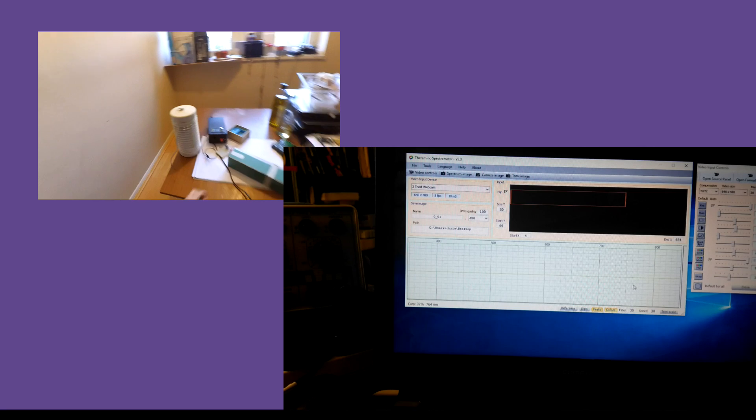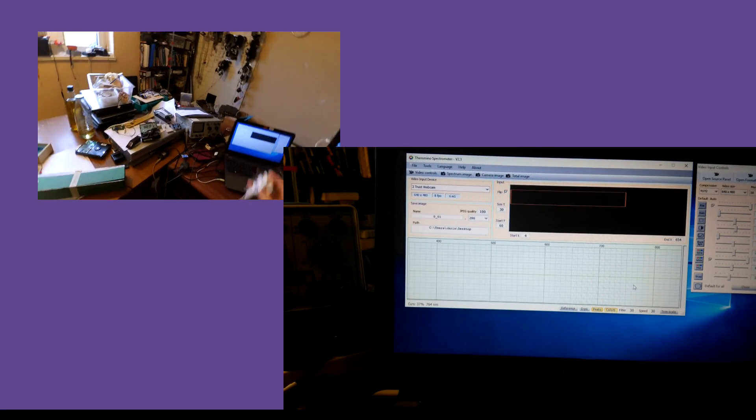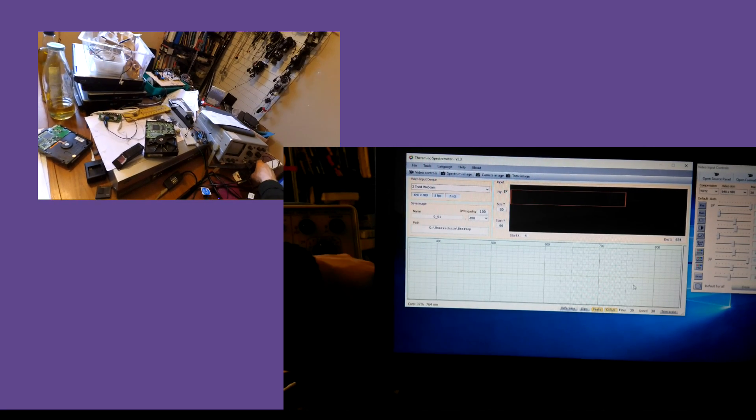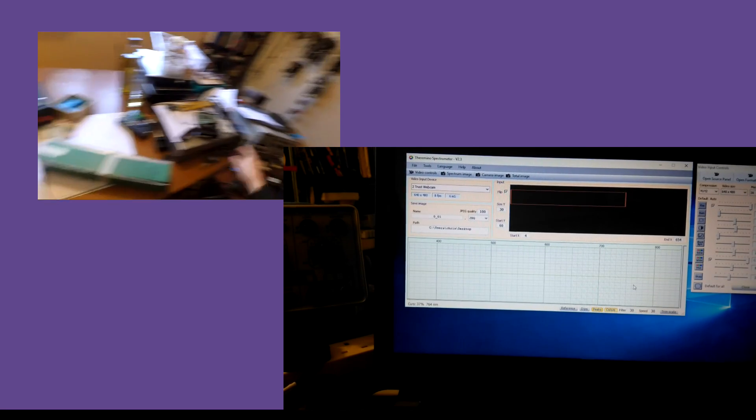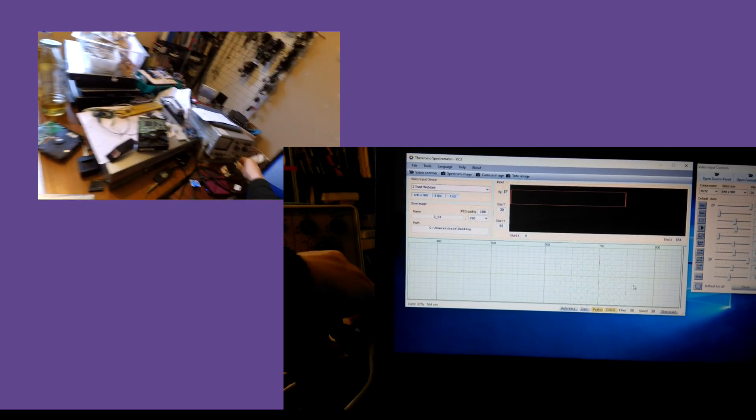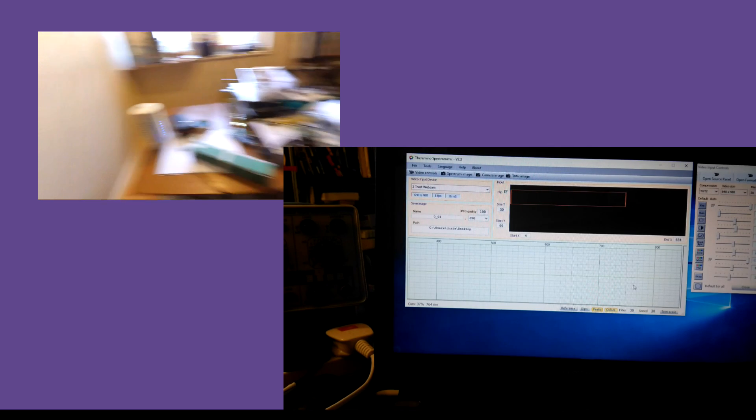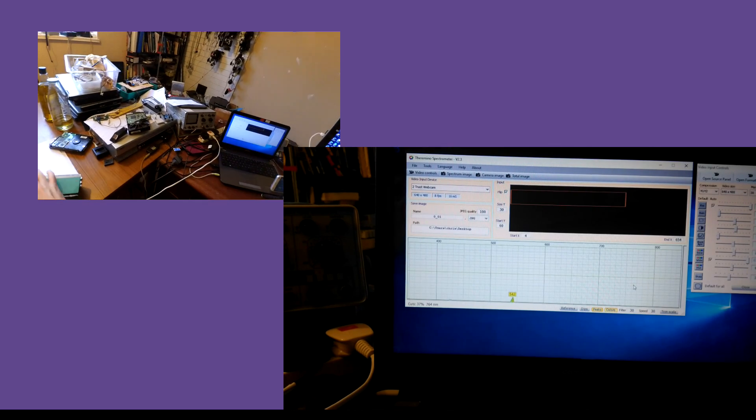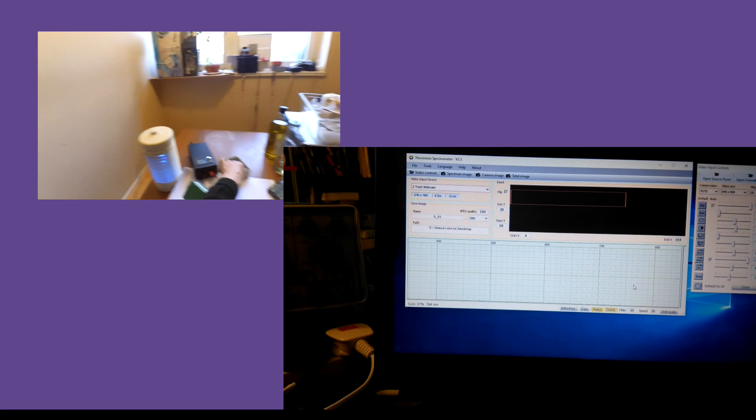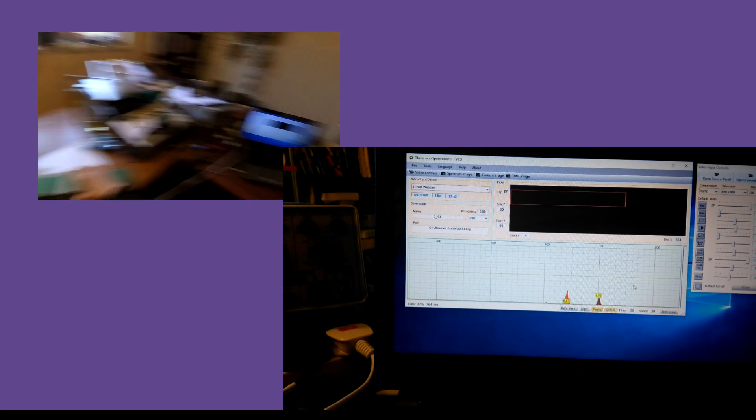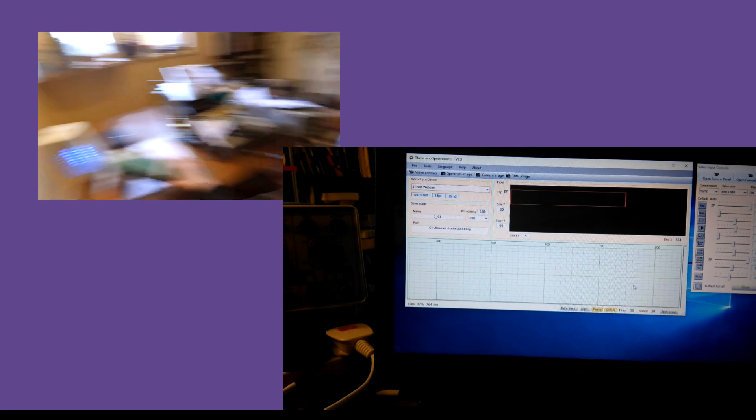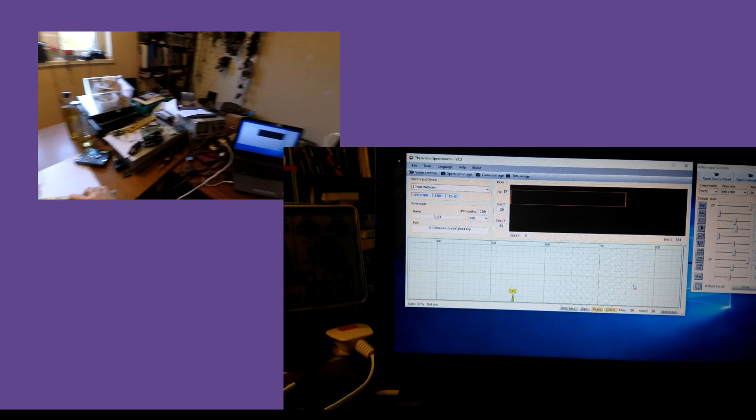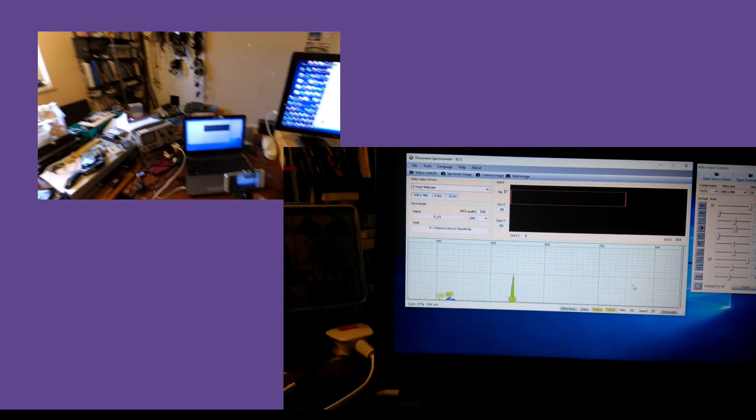And see what the spectrometer reads for output there. Oops. Let's see what we can do.